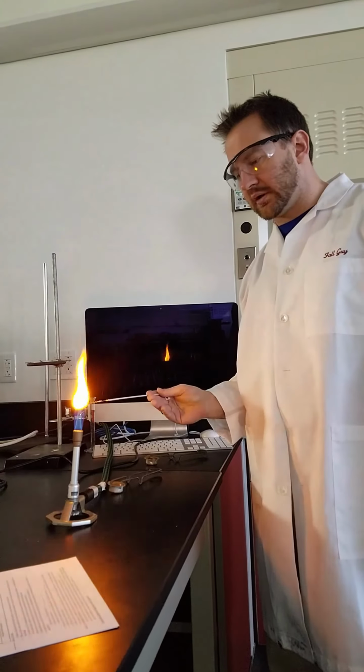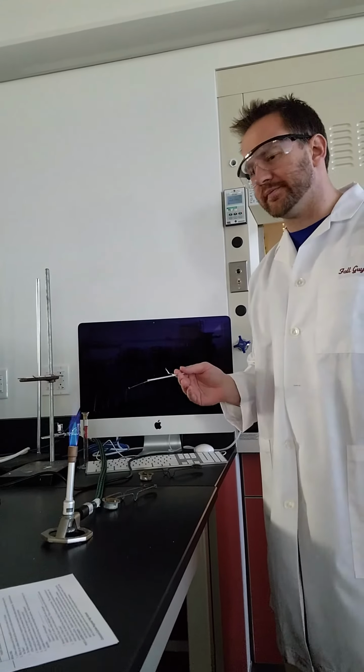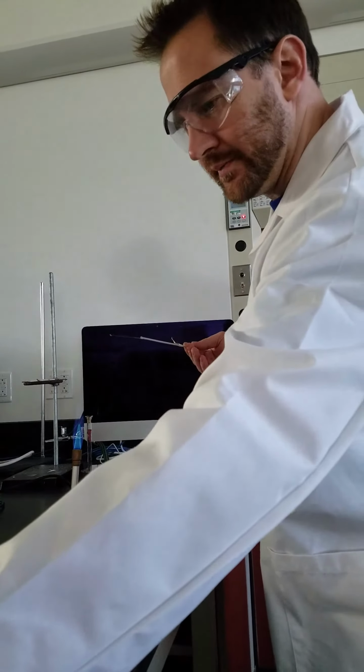The first one we're going to look at is sodium, and you can see the color of that flame, nice bright orange. But when you're recording your data or your observations, please use at least 2 words when you're describing each color to be a little bit more specific. Use your own judgment. Now we're going to look at lithium.